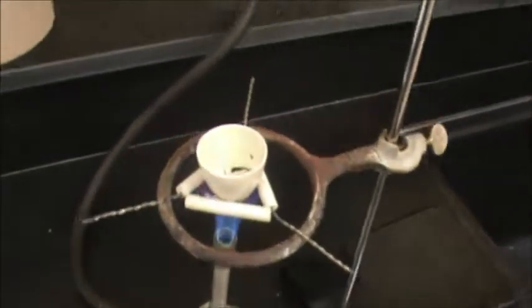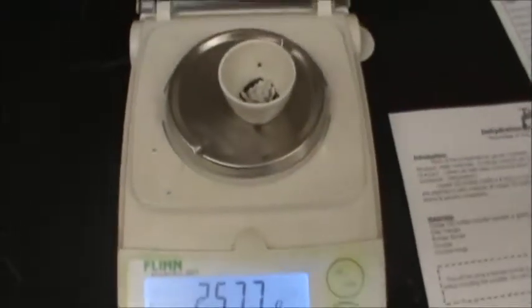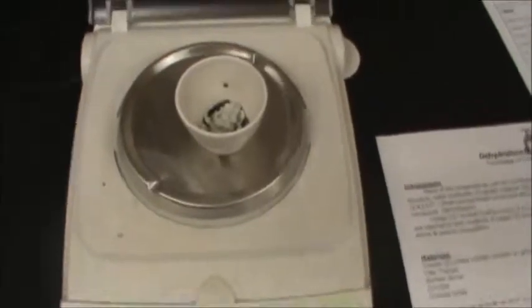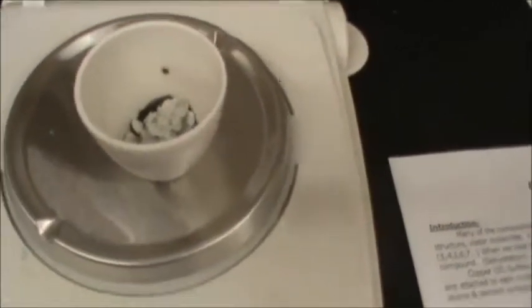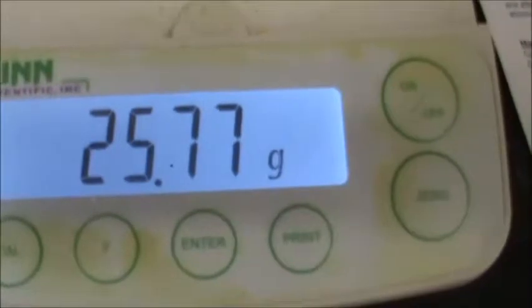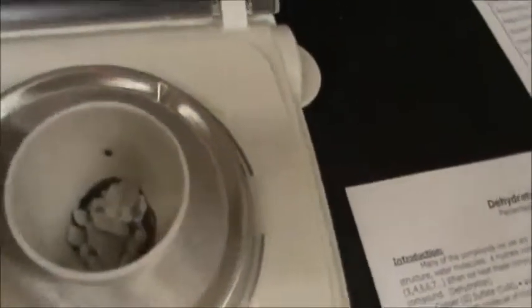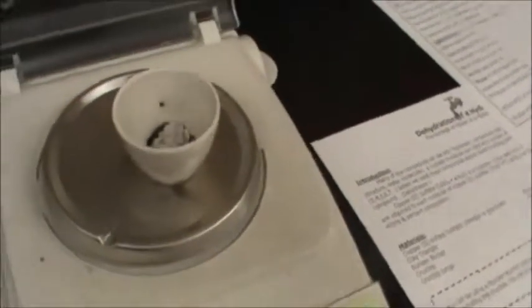I'm going to turn off my flame because it's been completely dehydrated, and I'm going to let it cool off for a little bit. Now I moved my crucible, it's been cooling off for a while, over to the scale. The digital scale now reads 25.77 grams. That's the mass of the crucible and the copper sulfate after my heating. If I make my observation again, if you want to take a closer look, there is my copper sulfate. It's got more of a chalky white substance to it than anything. It's not a pretty blue color anymore.